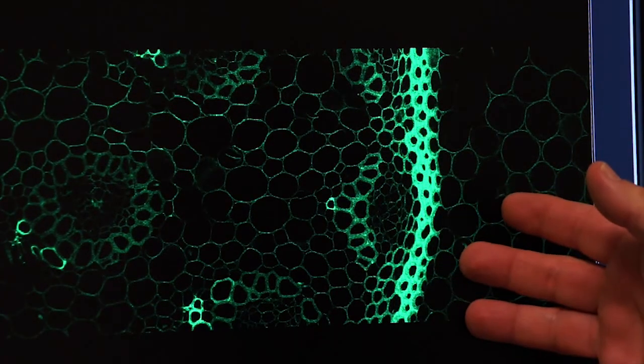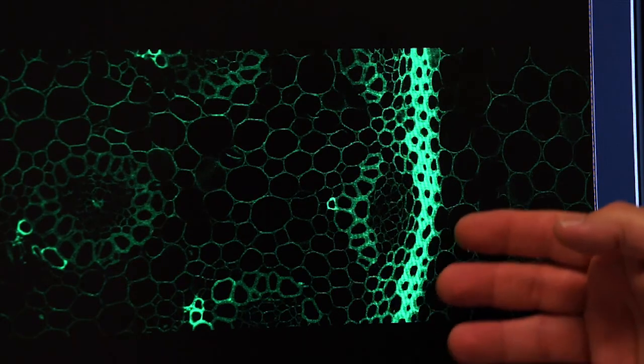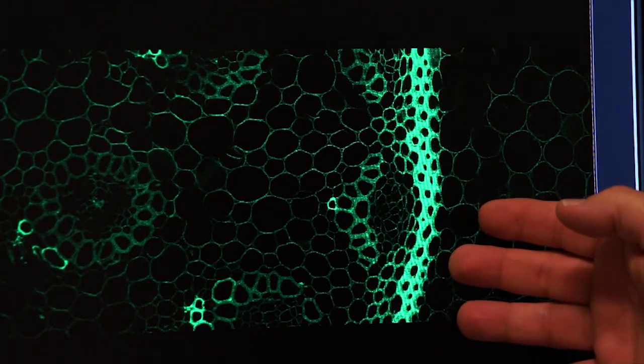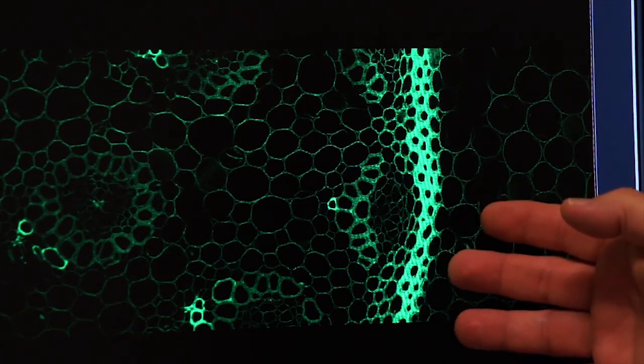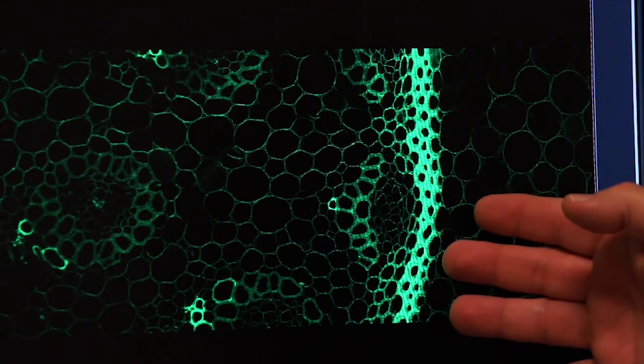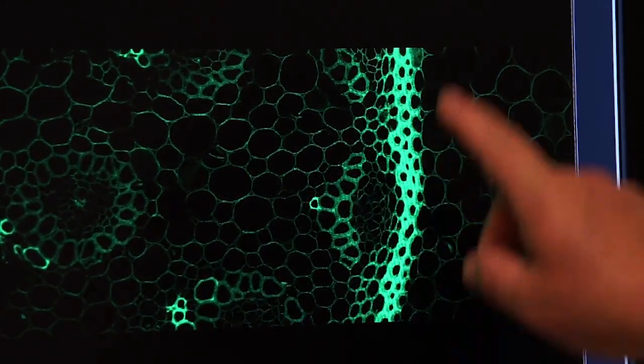Now, in this particular specimen, we're only doing autofluorescence. There's no fluorophore incubated or attached to this tissue. It's merely reacting to the laser light that is hitting it. And so in this sense, there's no cause for worry about photo bleaching. But when you're working with your live specimens and you've used a fluorophore, always be aware that whenever the laser is on, you're exciting that fluorophore and you're photo bleaching it. It's going to fail to give off energy after a period of time.